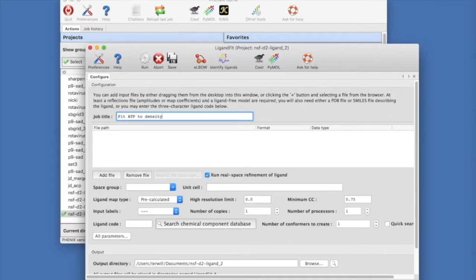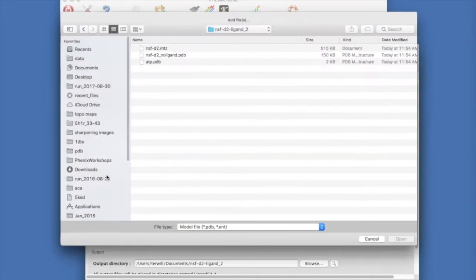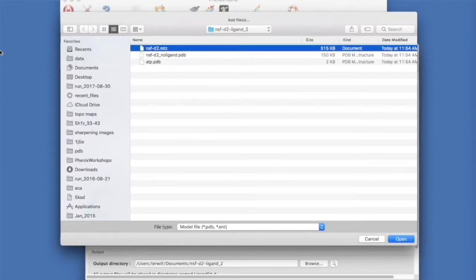Click Add File and you will see the content of the tutorial directory. NSF D2.MTZ contains measured data for this protein ATP complex.